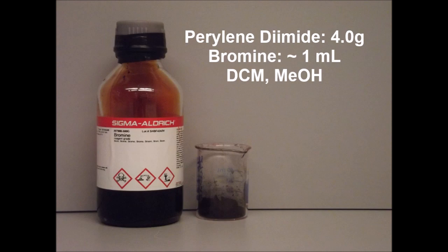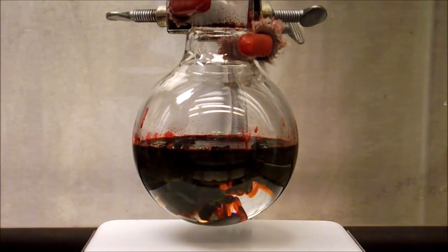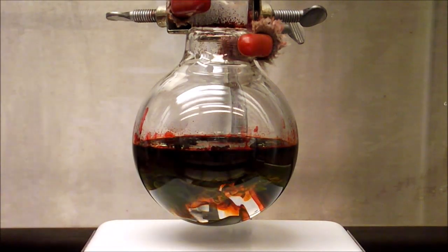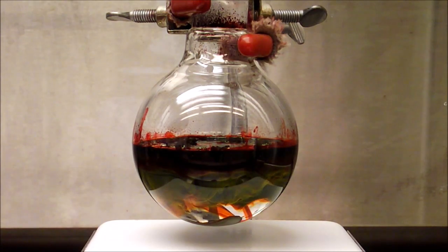For this reaction we will require bromine and n-hexyl PDI which we made in a previous video as well as dichloromethane and methanol as solvents. First, to a round bottom flask containing about 125 mL dichloromethane is added 4g of n-hexyl PDI. The funnel and the flask were rinsed with a small amount of DCM.